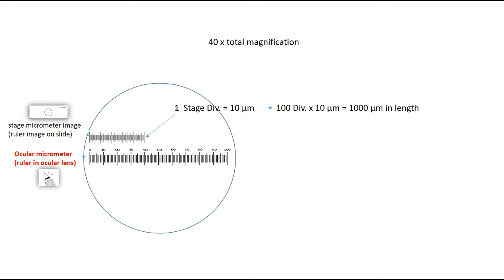How does this help me calculate specimen size? If I switch out my stage micrometer and replace it with a microscope slide containing an actual specimen, I can see that my specimen is approximately 6 divisions long based on my ocular ruler. I now know that one division equals 25 micrometers. So: 6 divisions times 25 micrometers means my specimen is 150 micrometers in length. Easy enough.